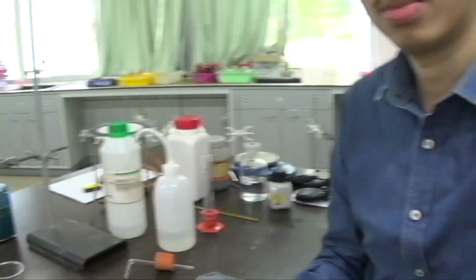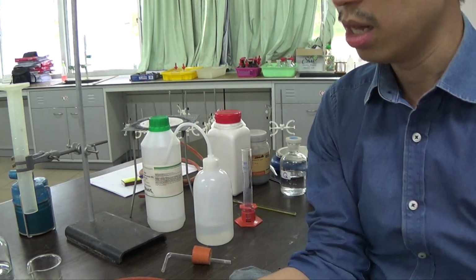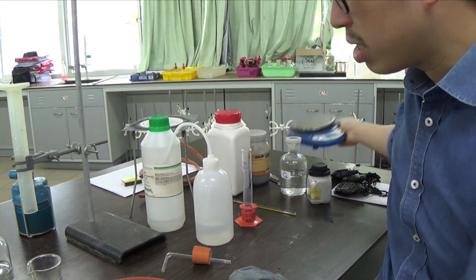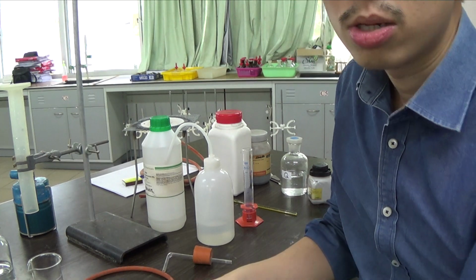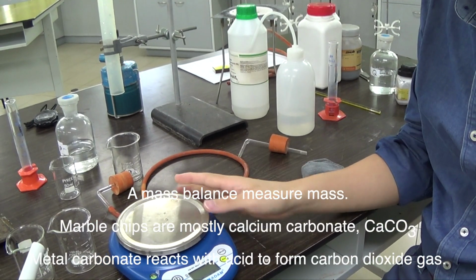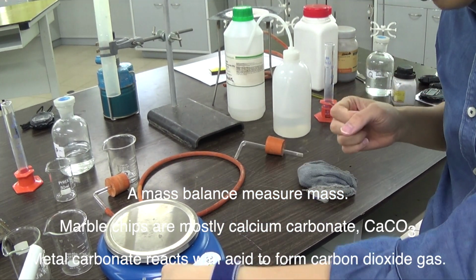I'll start off by talking about the first factor, which is to do with surface area. So let's just get started. I have got a mortar and pestle. So this is the mortar and this is the pestle. What we're going to do is crush some solid. I've got a mass balance here as well. A mass balance measures mass. It's called an electronic mass balance.